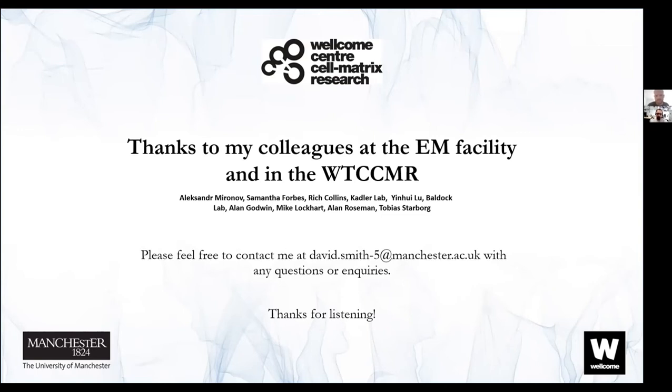With new methodologies like focal charge compensation, you do not need any water vapor, so you can create a much better vacuum, meaning much better resolution.